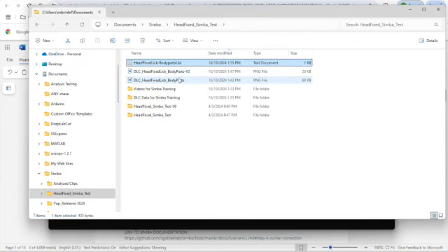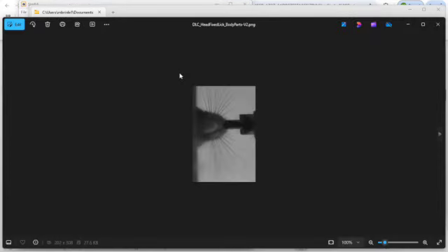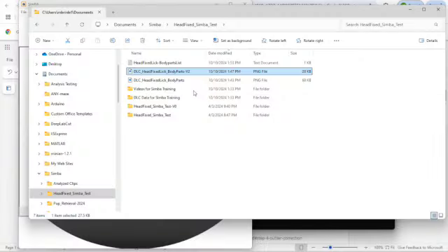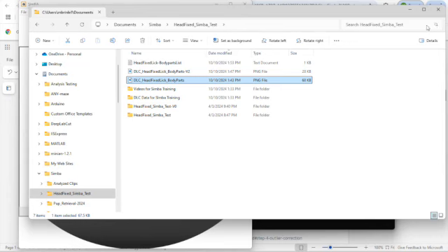I also have a couple images that I can use, one that has no dots on it, which is an image of the mouse view that I'm using. And then I also have one that does have some dots on it, that I could use for creating my project.